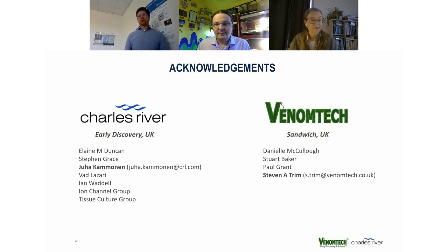Absolutely. I guess, Clint, at the moment we don't necessarily know the binding sites for all of these. That kind of work is ongoing, and Steve and I were laughing because just today I spotted a publication in PNAS on exactly the same kind of thing from the spider showing activity on sodium channels. So it's very opportune timing, and they showed some structure in there. So I think that work is ongoing. For these particular venom fractions and toxins, we don't have that information yet.